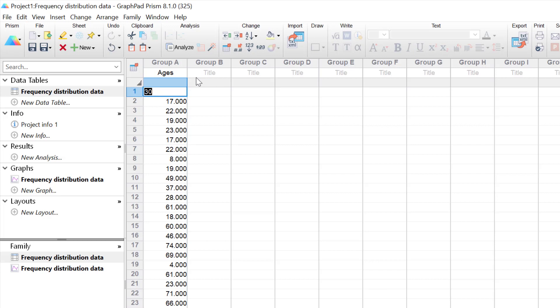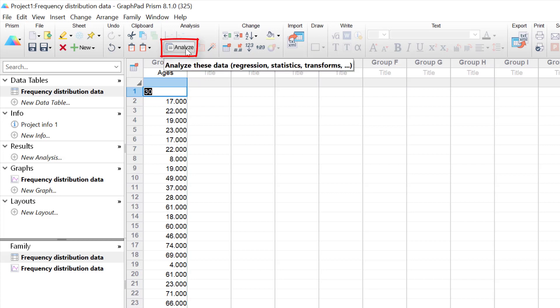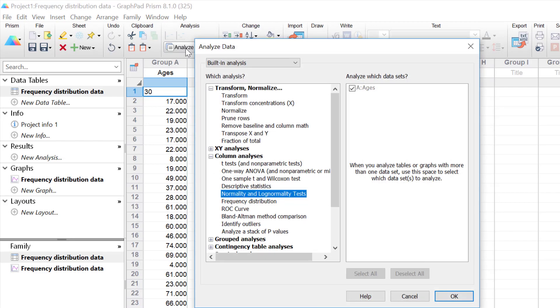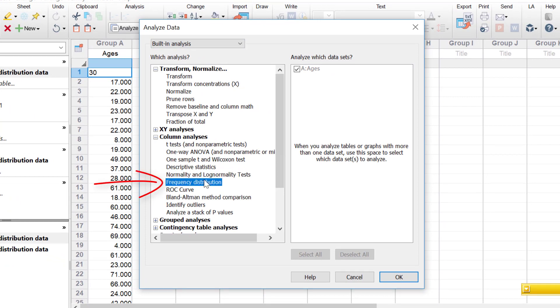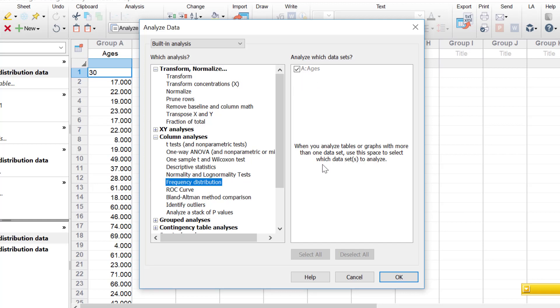To generate a frequency distribution of this data, go to Analyze and click it. Under the analyze data wizard, find the option for frequency distribution under the column analyses header. On the window on the right, enable all the datasets you want the frequency distribution for, then click the OK button.